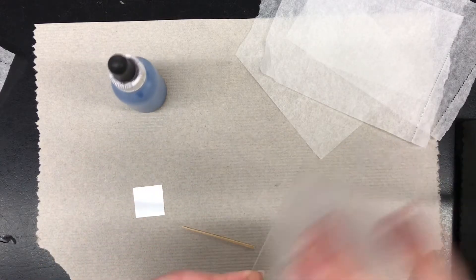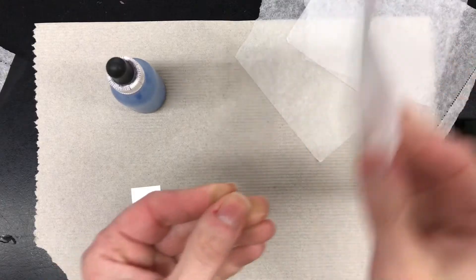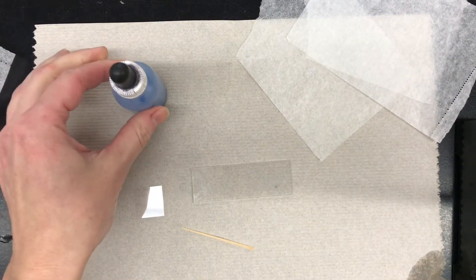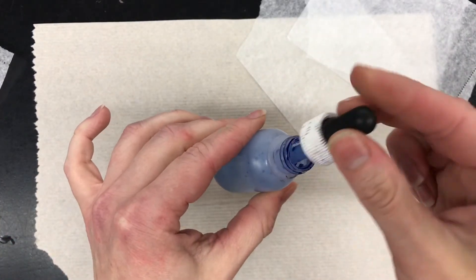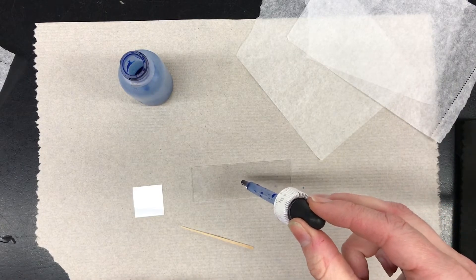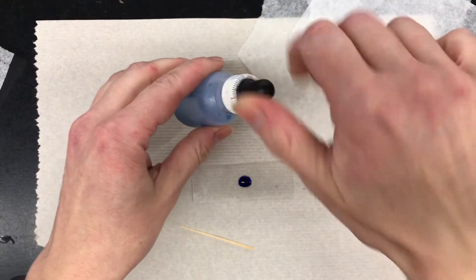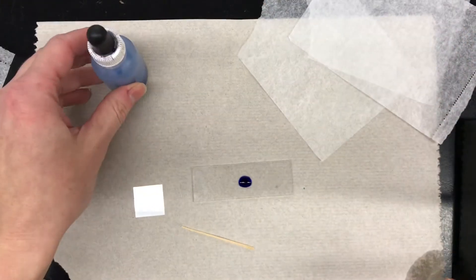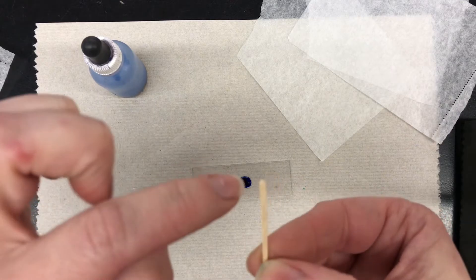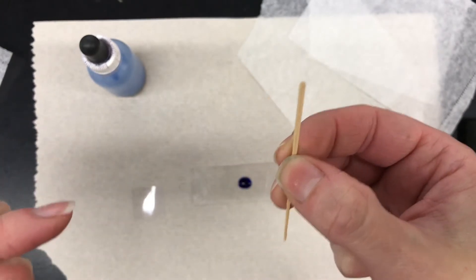First, make sure that you have a nice clean slide. You can use your lens wipe to clean it off. Take your methylene blue — you just need a little bit — and put a small drop right in the center of your slide. Put the cap back on the methylene blue. Then take your toothpick and use the rounder side — not the pointy side — and put it on the interior of your cheek.